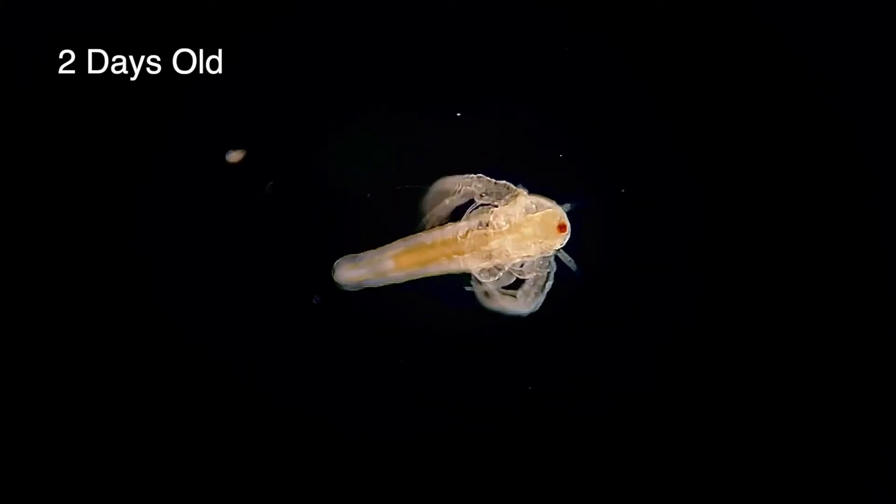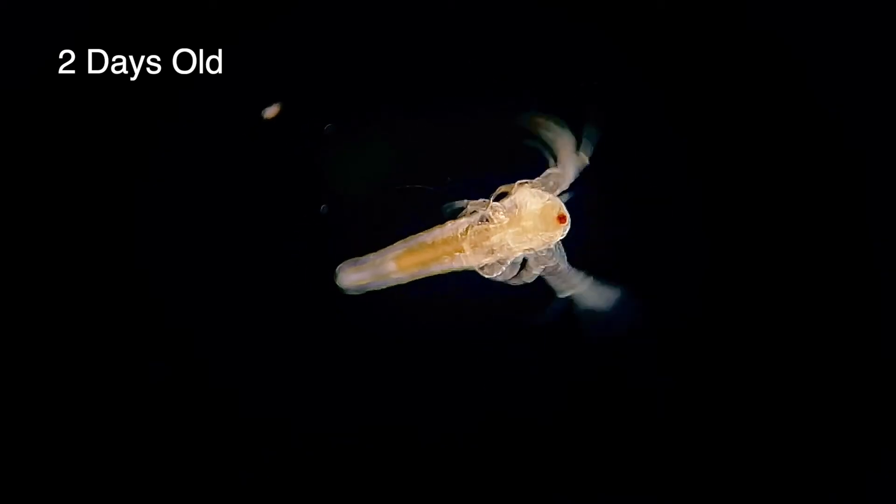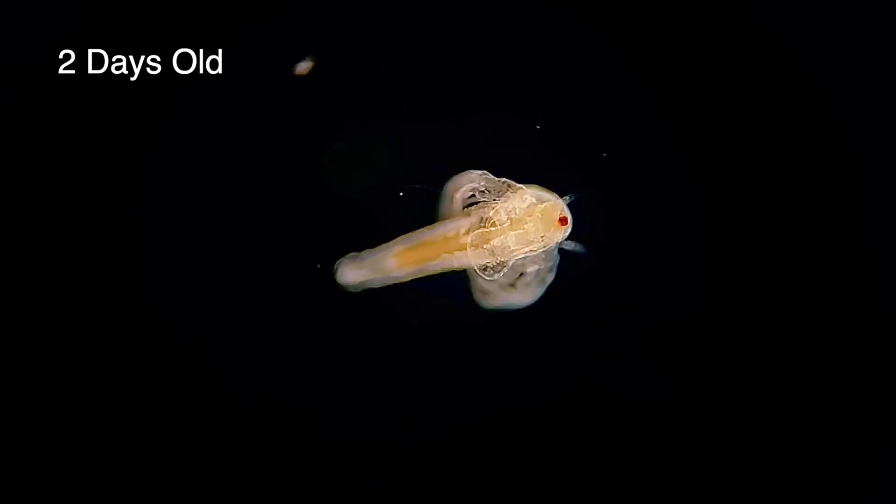It only takes around eight hours before they shed their exoskeleton for the first time and morph into the second nauplius stage. Here you can see the body has already begun to grow longer and the antennae that they use for swimming have got a lot bigger too.